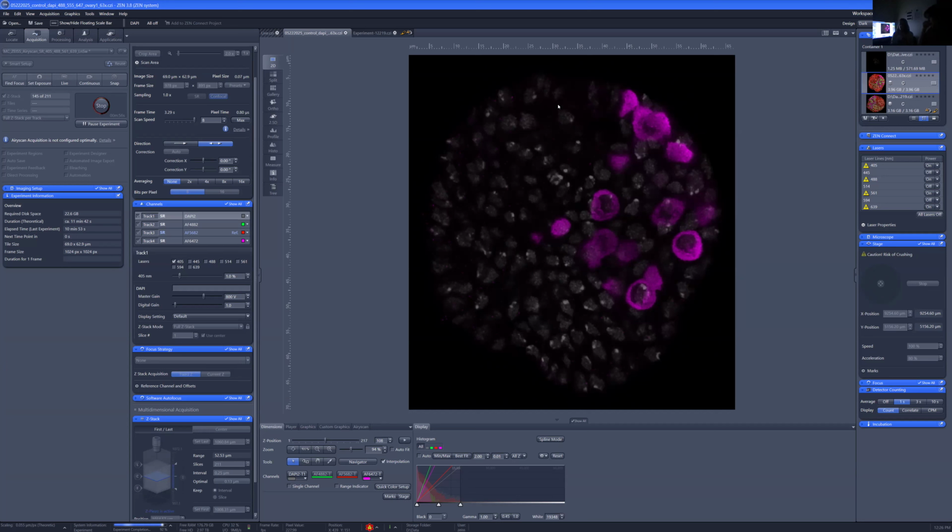But at this point, even non-AI programs are pretty good, and they're also just a little bit easier to run and easier to operate. In order to use this neural network that I'm talking about, you have to spend a lot more time invested in training the neural network. And so I think my collaborator and I decided that this balance of training versus benefit is right, but it's possible that in the future I will transition to using more artificial intelligence in my analysis.